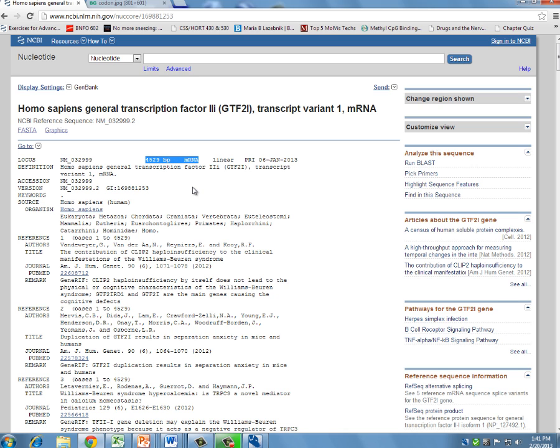And here you should also compare this size of the mRNA to the size of your gene and comment on whether the mRNA is significantly smaller or not than the actual gene. In my case, the gene was 102,000 base pairs, and you can see that the mRNA is a lot smaller. It is a lot shorter in length than the gene.